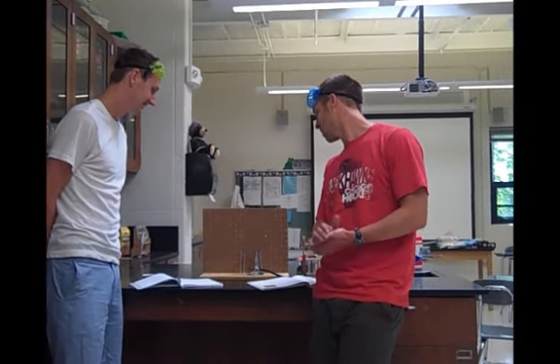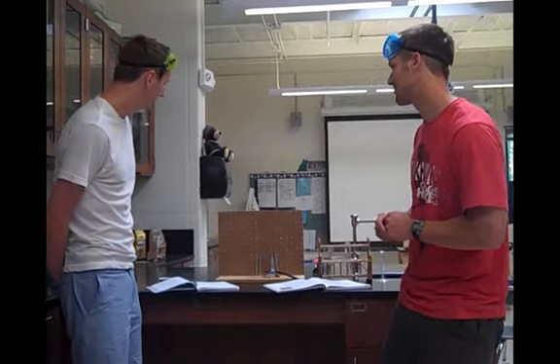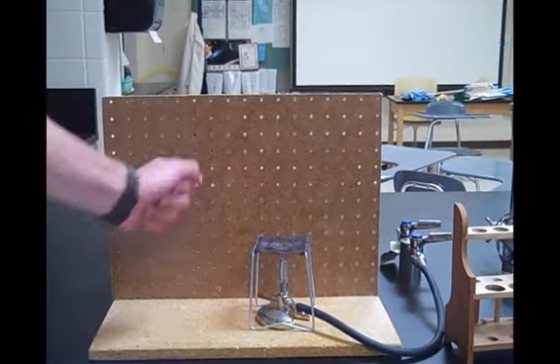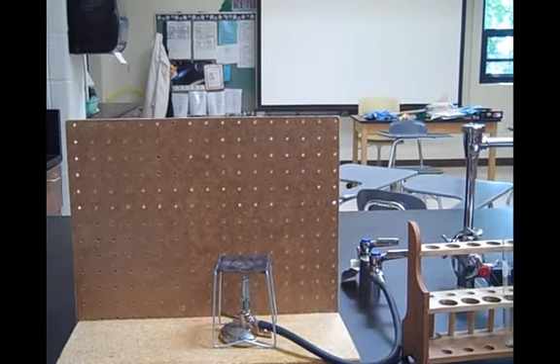Today we're going to do experiment 4.3, which is called comparing the concentrations of saturated solutions. So the first thing you're going to want to do in your lab today is grab your materials from wherever they're located in your classroom, bring them back to your desk safely, do not break anything. Once you have everything back to your desk, you're going to have your simple setup: pegboard, burner stand, Bunsen burner.